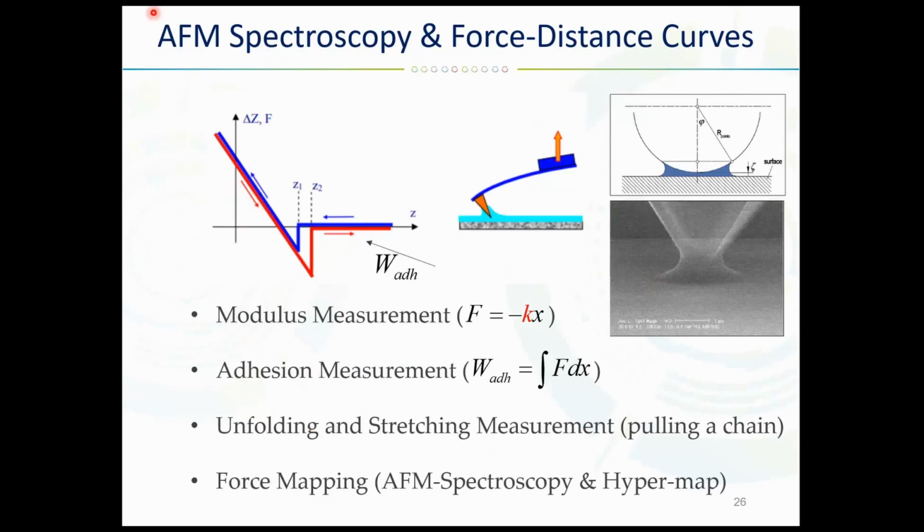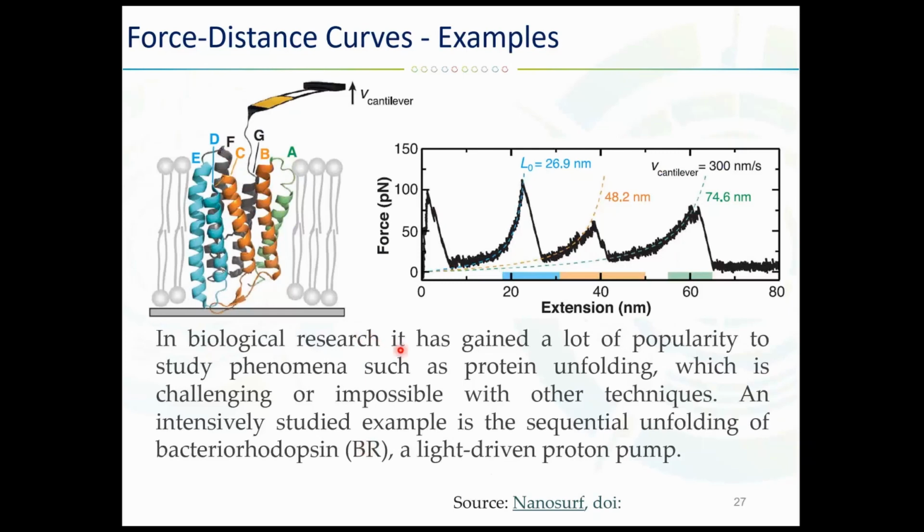Oops, sorry. And as an example is here, we are doing the unfolding and stretching measurements of bacterial rhodopsin. I've already mentioned it today. Bacterial rhodopsin can be unfolded using AFM.